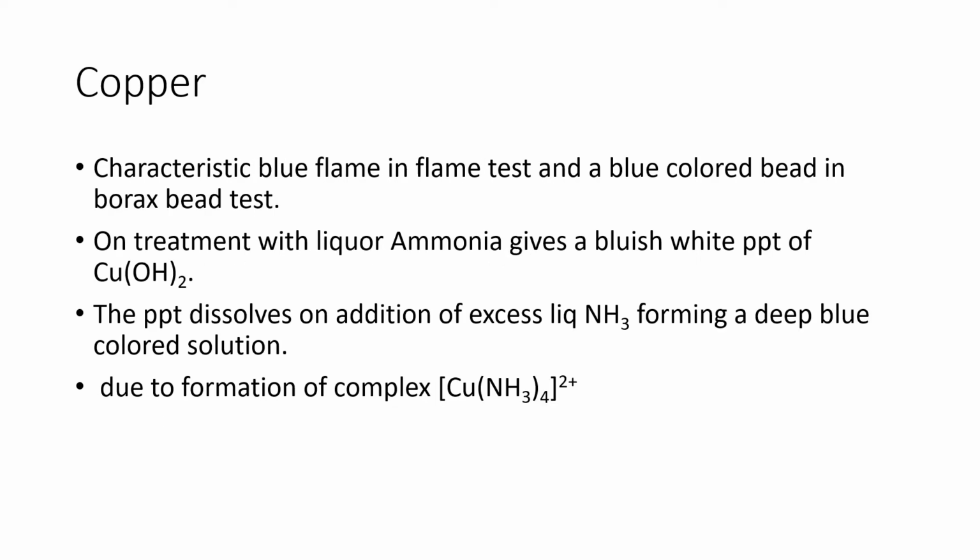Copper gives a characteristic blue colored flame in the flame test and a blue colored bead in the borax bead test. If a copper +2 aqueous solution is treated with liquor ammonia, initially a bluish white precipitate of copper hydroxide is obtained. This precipitate will dissolve on the addition of excess liquor ammonia. Ammonia will be acting as a coordinating group over here and a deep blue colored solution is obtained, which is due to the formation of the tetraammine complex of copper.